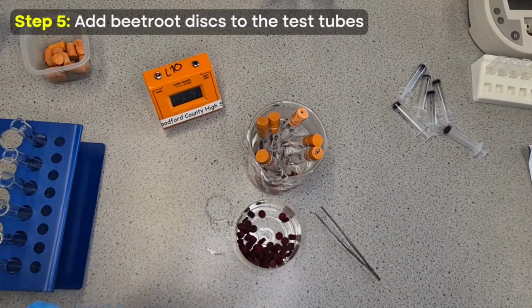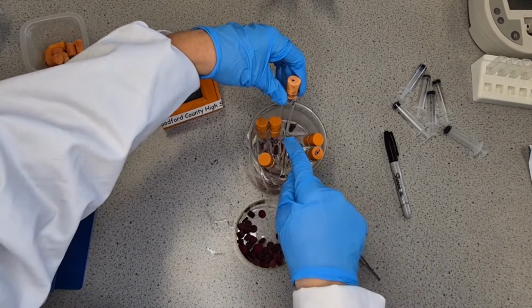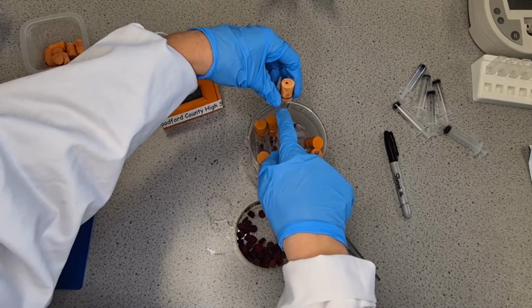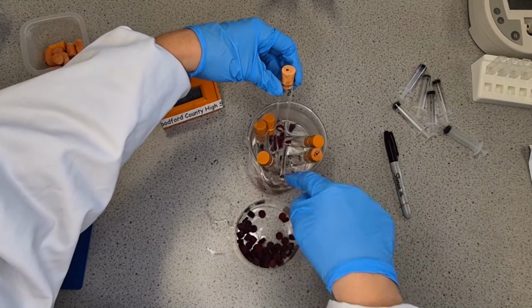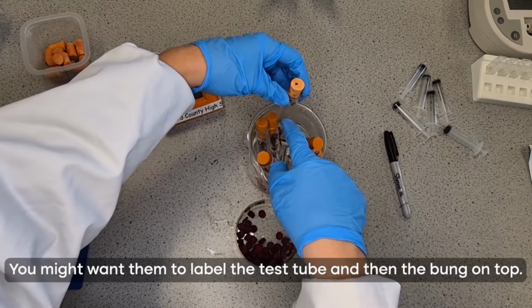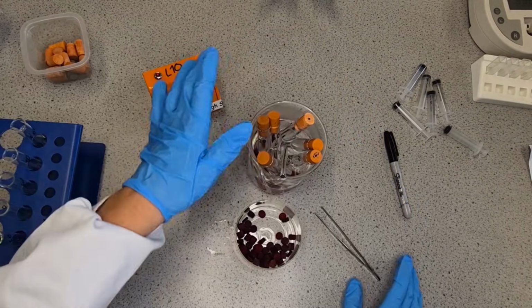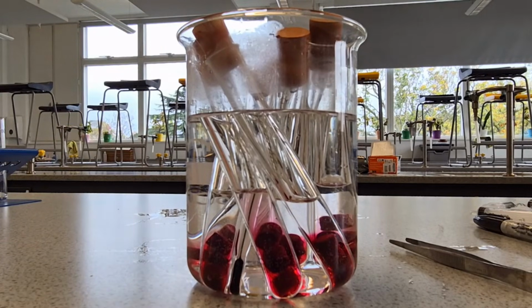100, there we go. So that's one thing just to be aware of. I've noticed that because ethanol is a solvent, some of it must have got on the outside, because it's actually washed off this here. But by default, or process of elimination, I managed to work out that was my 40%. So you might want them to label the bottle, the test tube, and then also the bung on top as well. Okay, we'll leave that going.